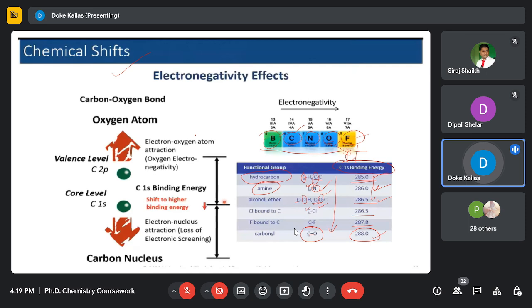So the bonding we can identify with the help of X-ray photoelectron spectroscopy. What kind of bonding we can determine with such an analysis requires precise literature knowledge of the binding energy of each constituent element, and its bonding with electropositive or electronegative atoms. The next slide is concerned with that student's question. Okay, next slide.